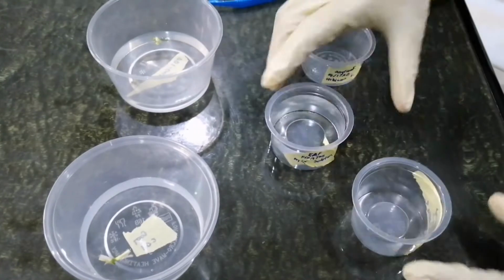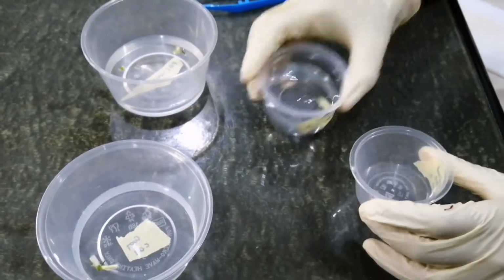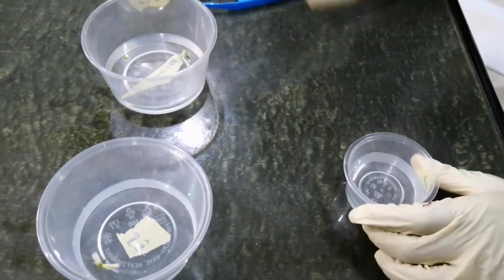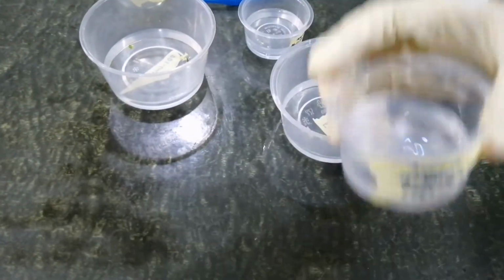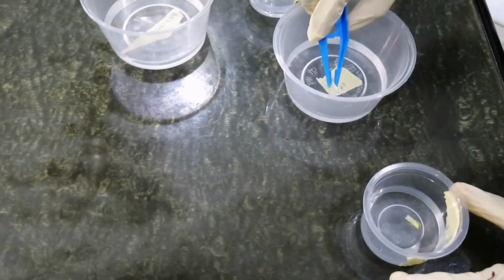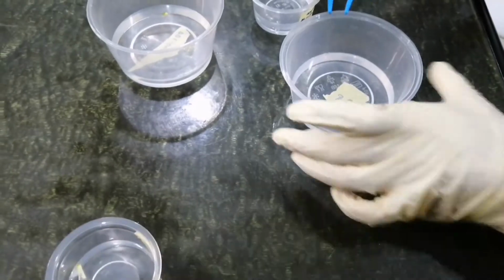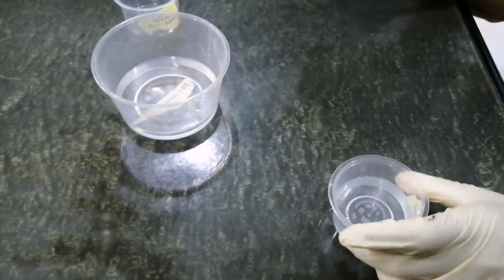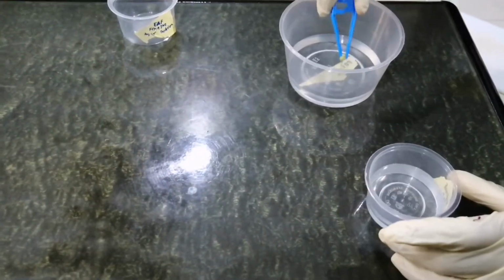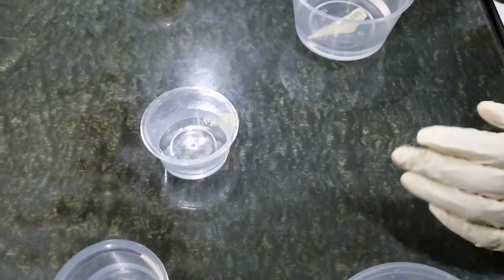So first, we transfer the EAF fixative mix solution into the labeled specimen bottle. After that, we immerse the specimen into the respective fixative solution, in which case cross sections go to the cross section bottle and longitudinal sections go to the longitudinal bottle. Make sure to remove the fixative bottle caps.